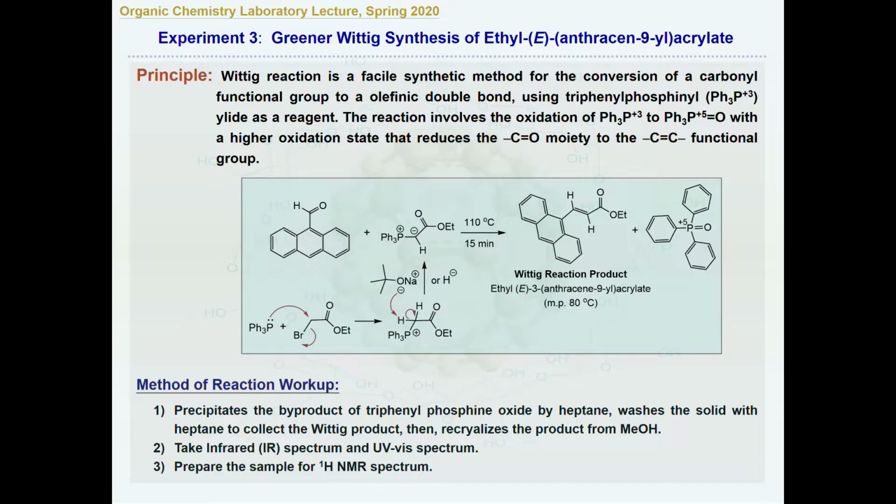Okay. From now on, we have to use online teaching to give you a lecture on organic lab. Next week, you will perform or observe how the experimental conditions are carried out by the TA. The experiment is Experiment 3, the Wittig reaction.